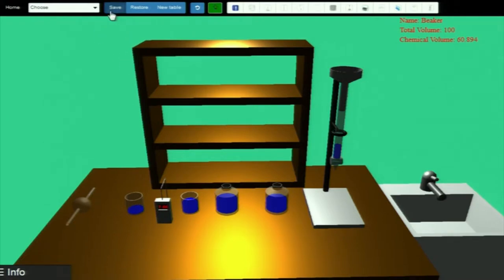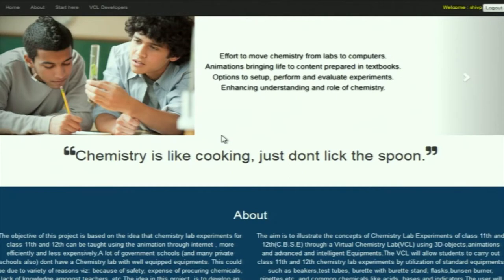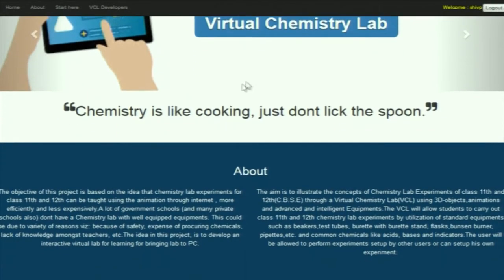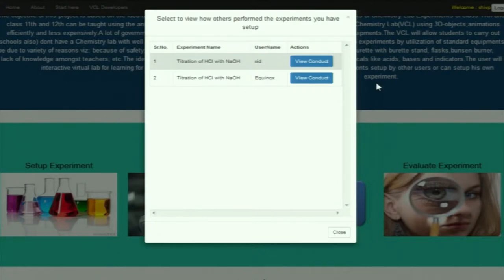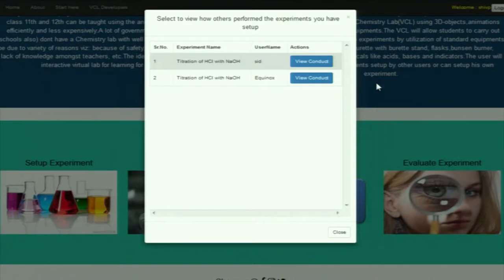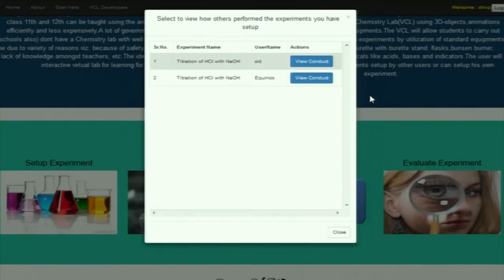If I save it, we are creating a journal of the experiment being performed and the teacher can evaluate what I did. Let me go to home and then go into my co-intern account. As I have set up an experiment for other students, I can view it from my account by clicking on the evaluate experiment link. I can see that two users have performed the experiment — one is Siddharth who performed it recently and another user is Equinox. I can see how they conducted the experiment by clicking on the view conduct button.